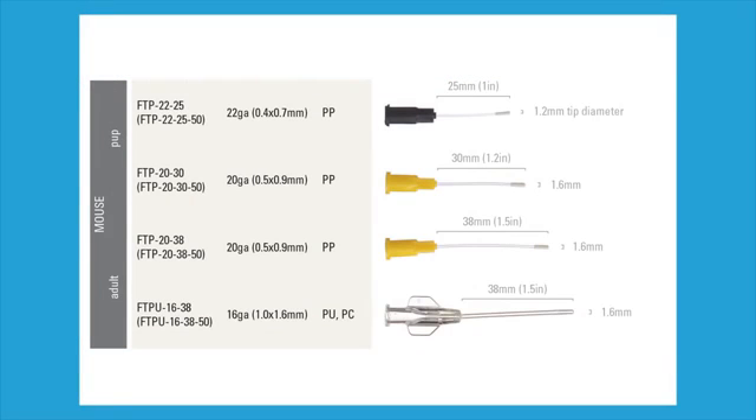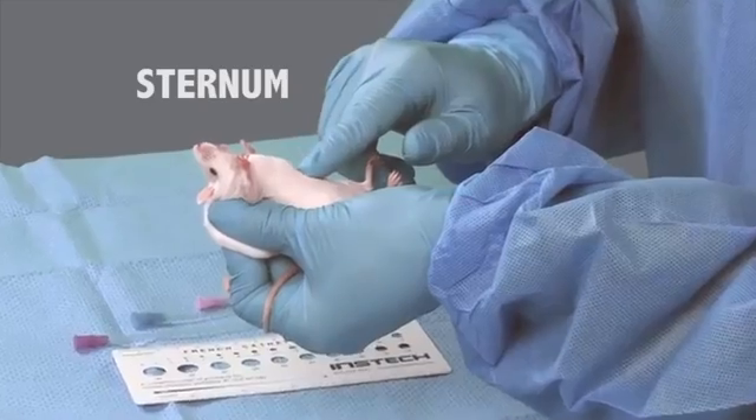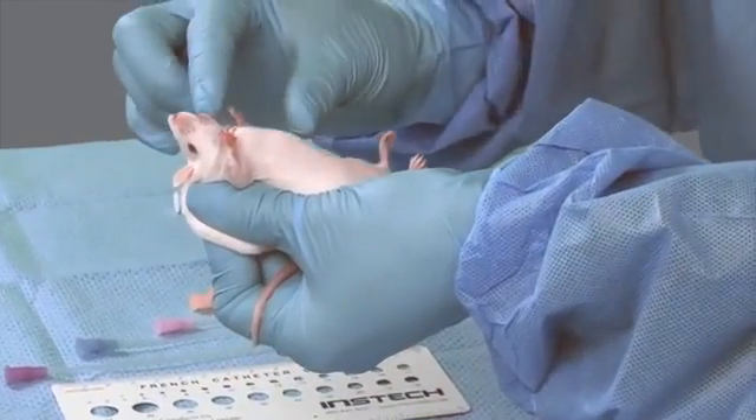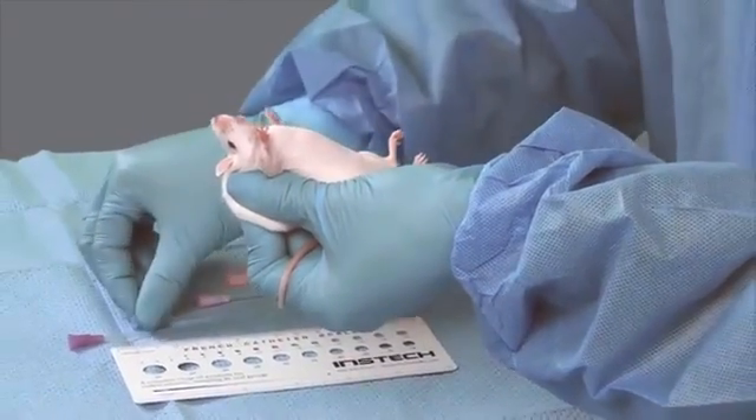It is important to select the correct size of feeding tube to ensure proper delivery of the compound as well as to avoid injury to the animal. Here are various sizes of mouse feeding tubes, with general size guidelines according to the weight of the mouse. The FTP 20-38 is the most commonly used size for mice. Here we see veterinary technicians assessing the appropriate size feeding tube to use. The feeding tube should be the length of the mouth to the bottom of the sternum.